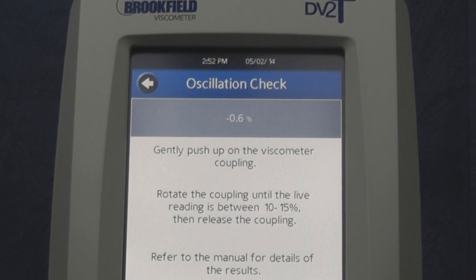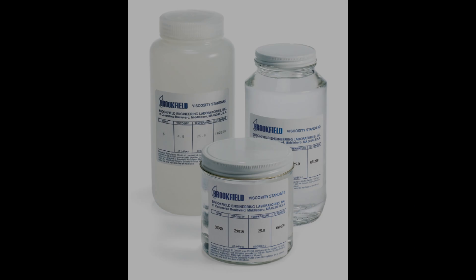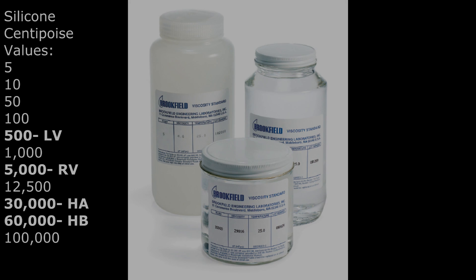If the unit fails the oscillation check, make sure the bubble level is centered, re-auto-zero the unit, and perform the check again. If it still fails, perform a calibration check using the appropriate standard as outlined in the operator's manual to see if the instrument is within tolerance. If this calibration check fails as well, call Brookfield Engineering or an authorized dealer to have the instrument serviced.